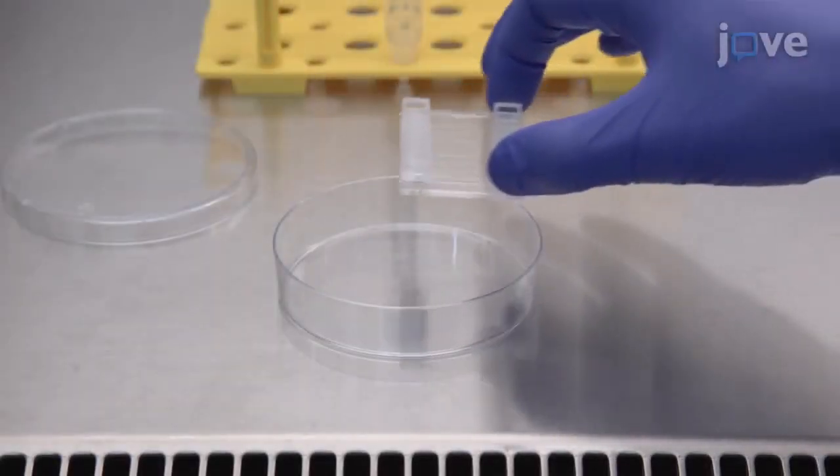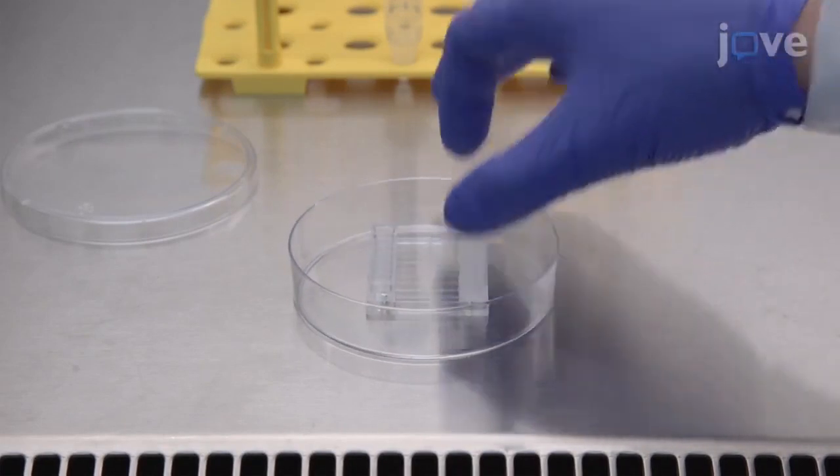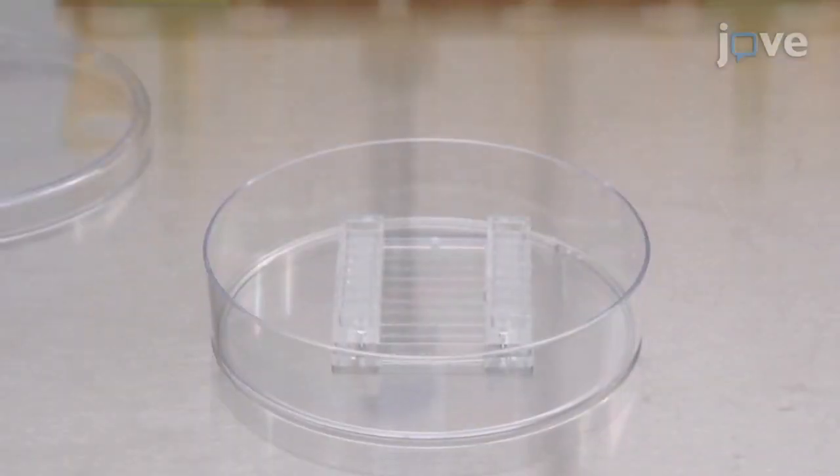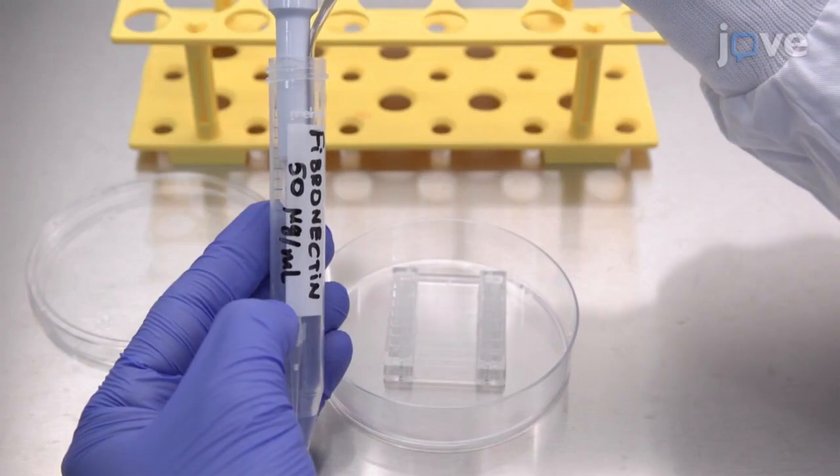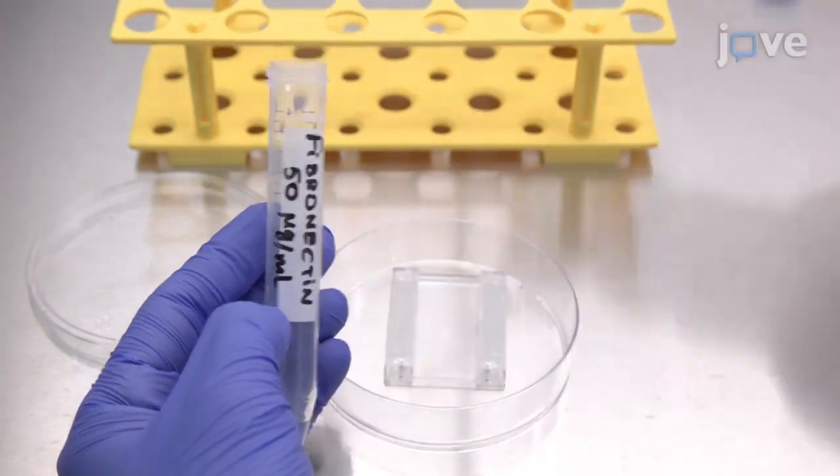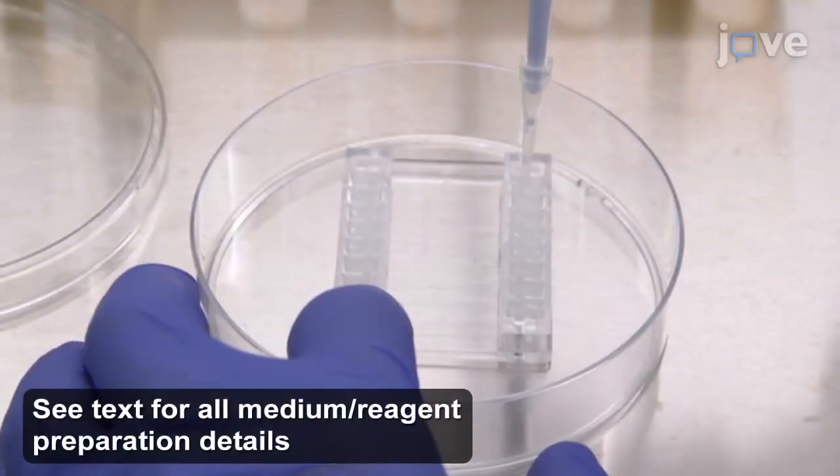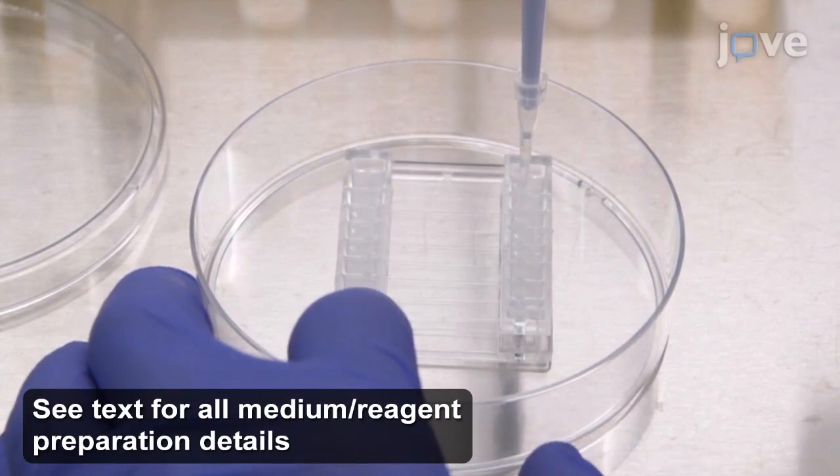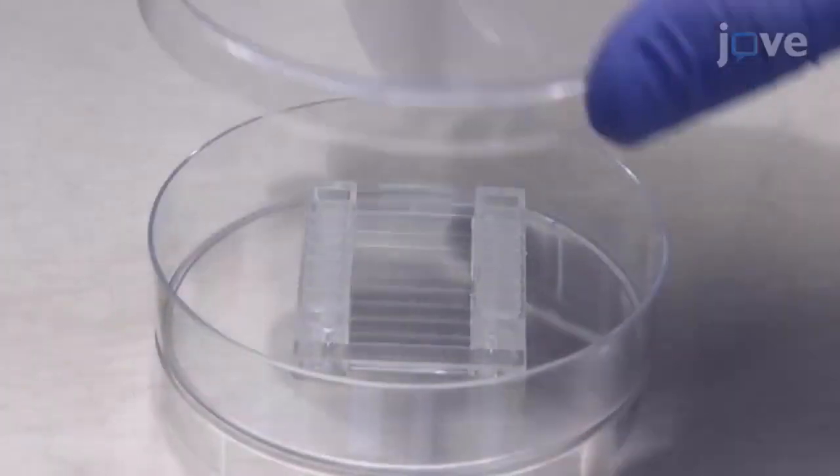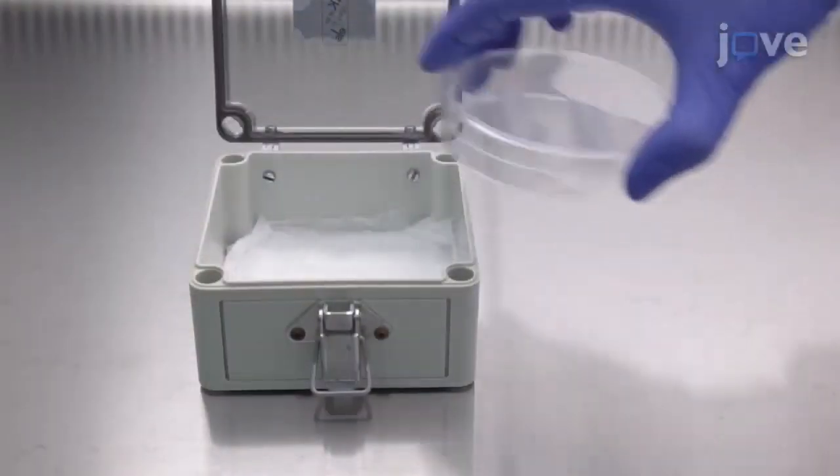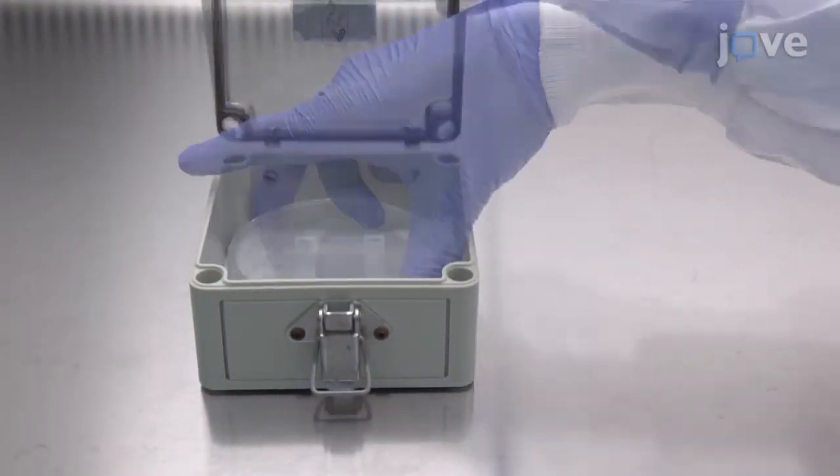For microfluidic chip coating, place a sterile biochip in a 10 cm sterile petri dish and use a 10 µL pipette tip to inject 10 µL of freshly prepared fibronectin working solution into each channel of the biochip. Cover the petri dish and place it in a humidified chamber overnight at 4°C.